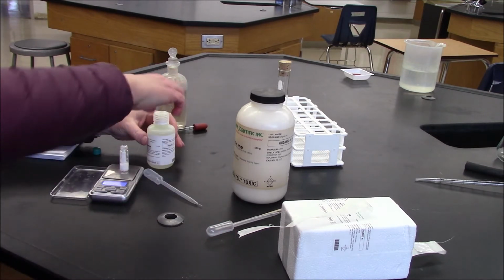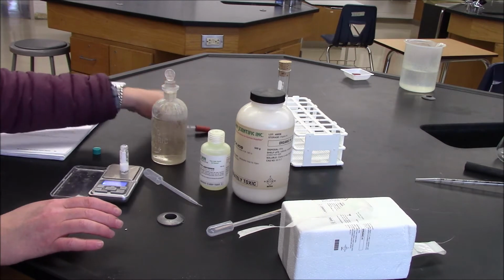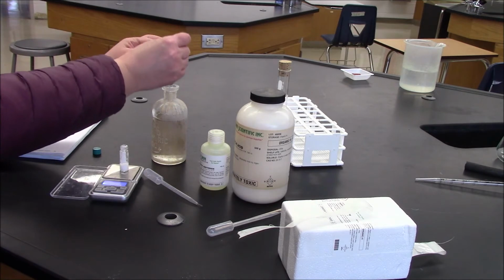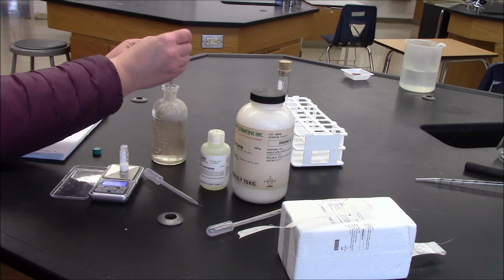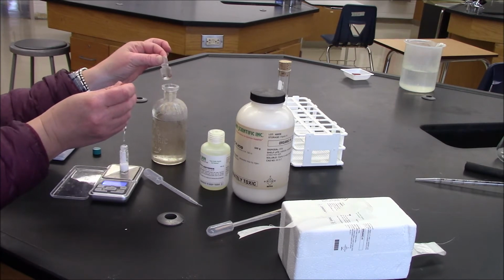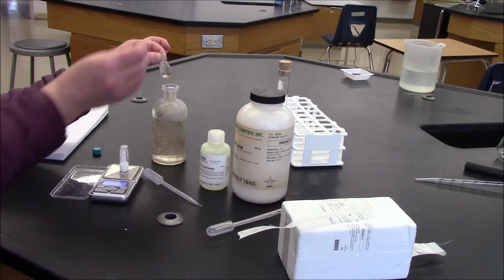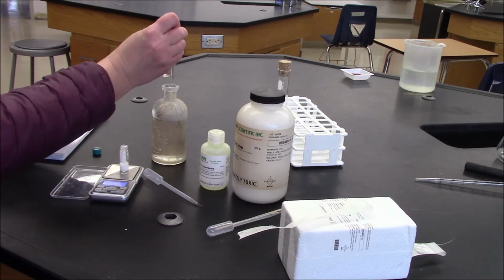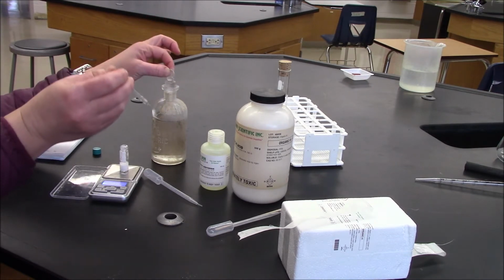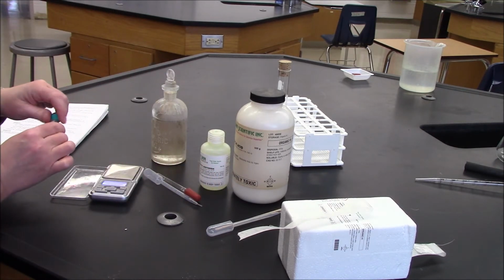Finally, I'm going to add 5 drops of my acid catalyst, sulfuric acid. Cap my reaction vial tightly.